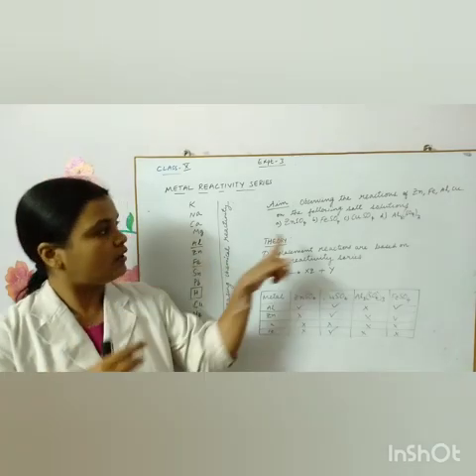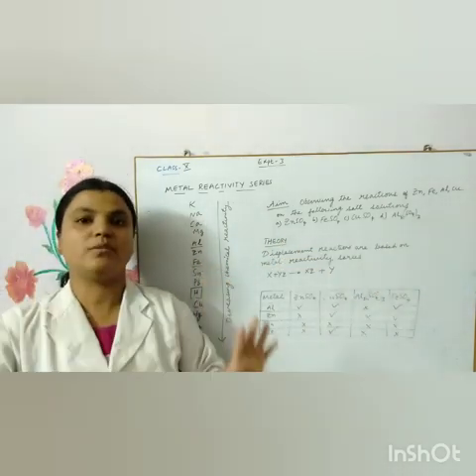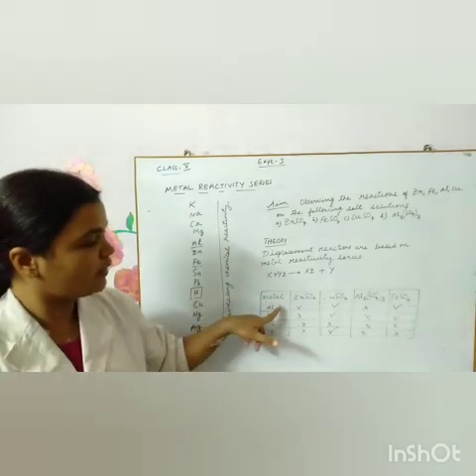Now we will prepare 4 sets like this. These 4 salt solution test tubes are one set. Like this, we'll be preparing 4 more sets. And what we are going to do is we'll be putting a metal in question.